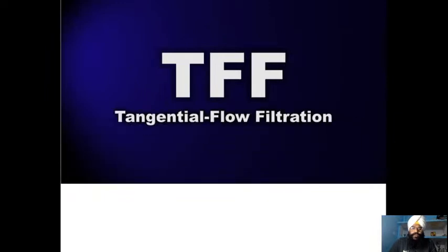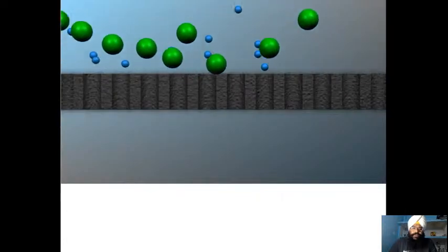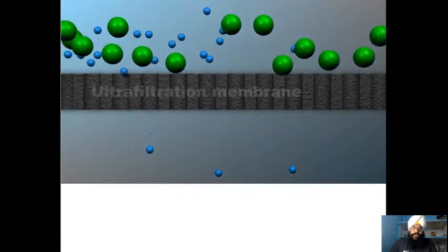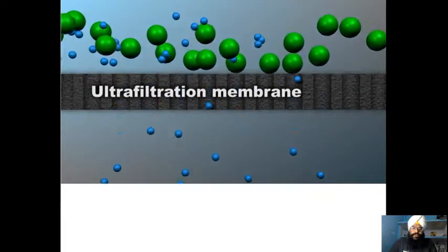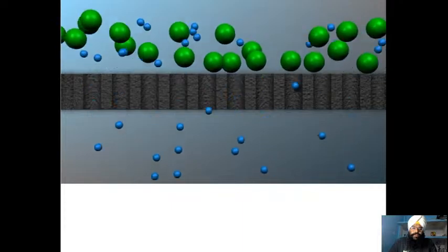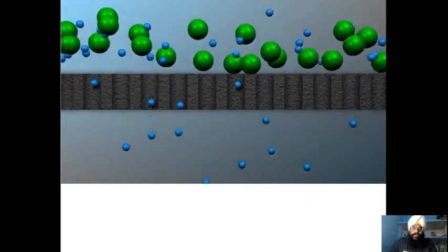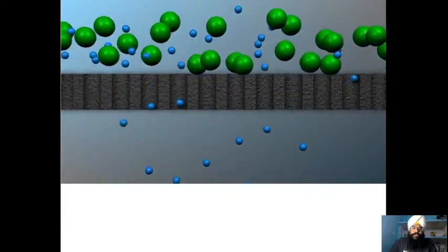TFF, Tangential-Flow Filtration, is at its heart a simple process step. We're going to pump a fluid through and across a special type of filter known as an ultrafiltration membrane. The size of the pores in the filter material determines what passes through and what's held back. As with almost any filtering process, we can choose what we want to keep.